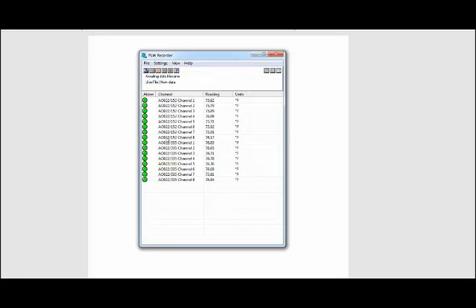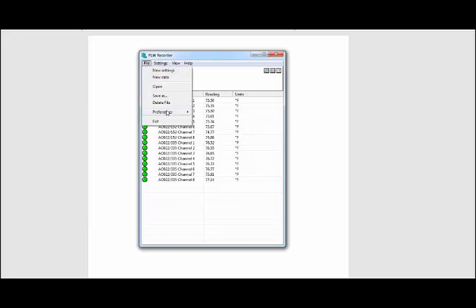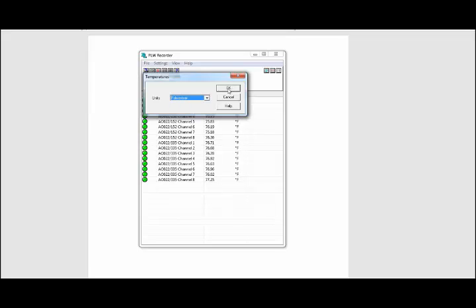Now it'll have both units listed on this spreadsheet here with all eight channels from each unit. It's currently in degrees Fahrenheit. If you want to change that, you can go to Preferences and Temperature and change the unit that you want to actually display.